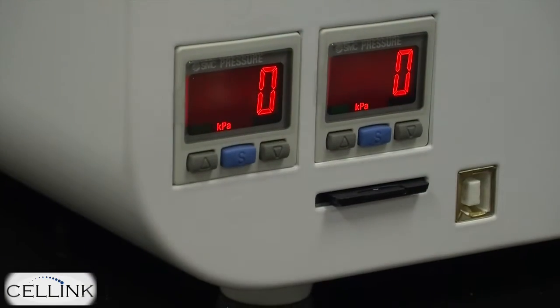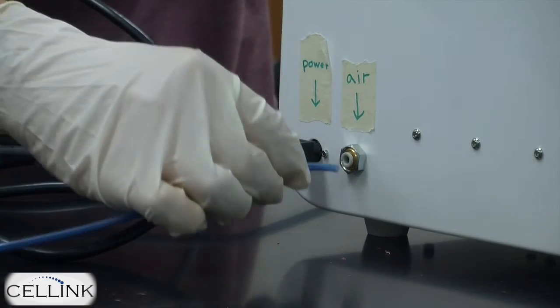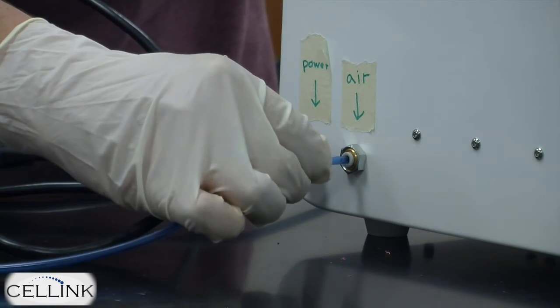Once this step is complete, you can go to the back of the bioprinter, plug in the air compressor, and turn it on.